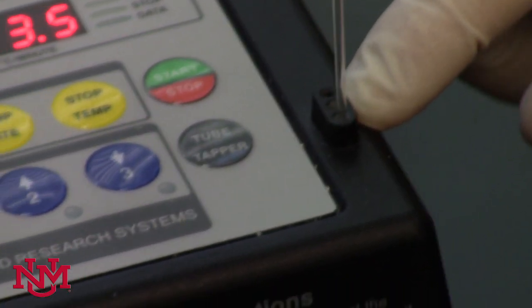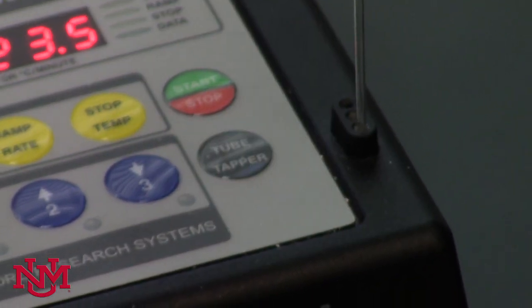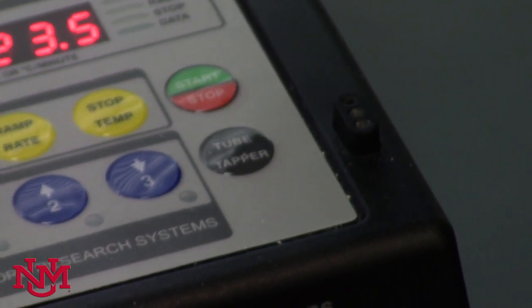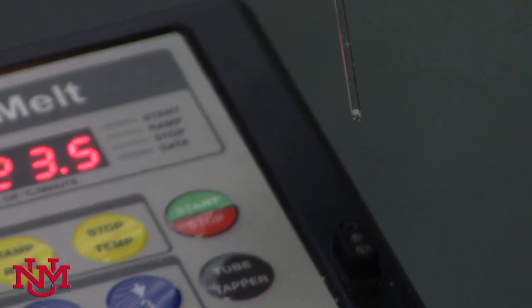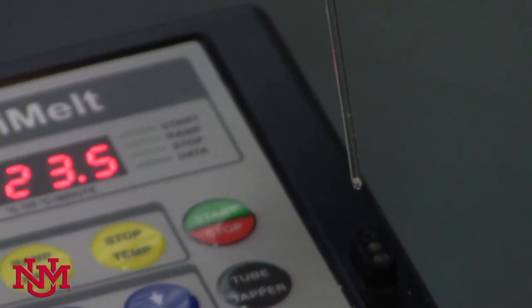Once you have it there, you can touch the button labeled tube tapper. Watch it shake the sample down from the top all the way down to the bottom. We don't need to have a whole lot of sample. The smallest amount that's visible in the capillary tube is all you need to obtain a melting point.